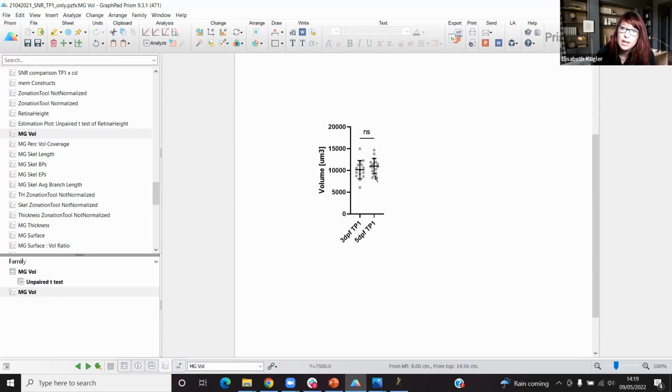But one thing that we do is we plot the data, and obviously we want to quantify this, so we use statistical analysis, but also an important thing for us at this point is seeing the variability. I think what we all know as biologists is that you have some kind of spread, but if some of your data would be up here and some of your data would be down there, you would know that something is not quite right. So just having this intuition of what your data more or less should look like in terms of spread is very, very important.